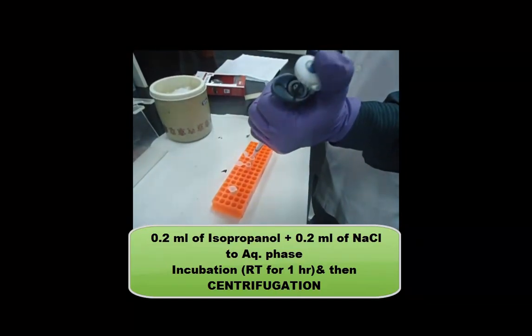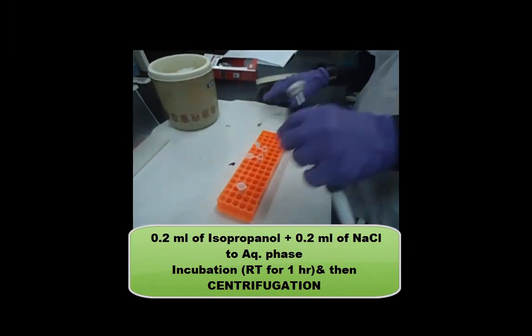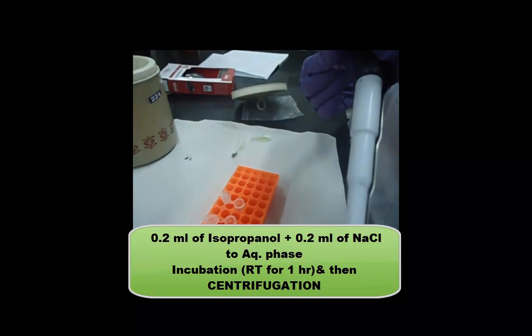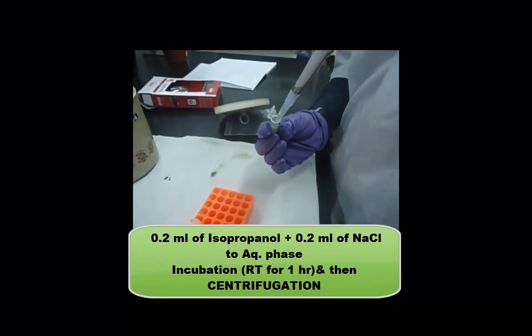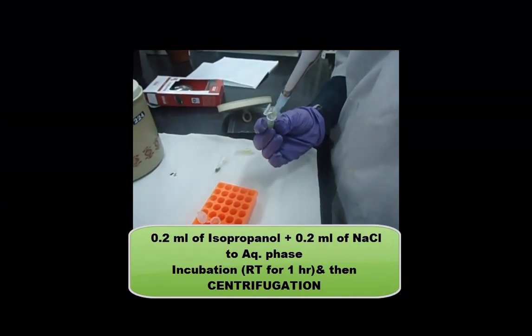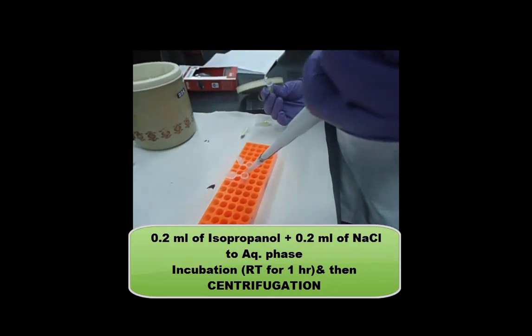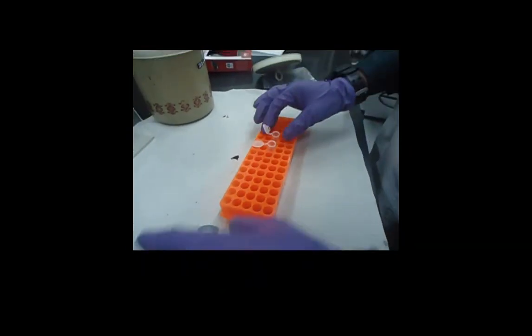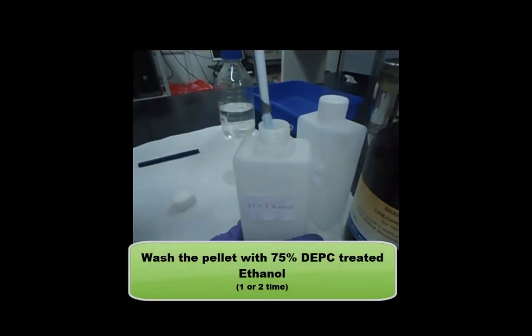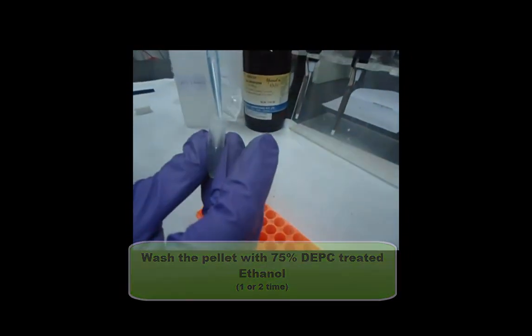Then take out the tube from the centrifuge, collect the supernatant and add 0.2 ml of isopropanol, 0.2 ml NaCl and incubate this tube at room temperature for 1 hour. Again follow the centrifugation at the given condition. Then wash the pellet with 75% DEPC treated ethanol.